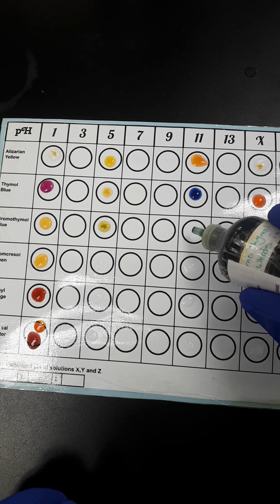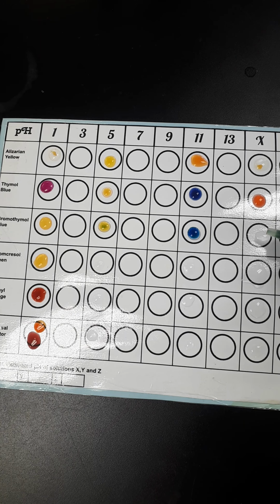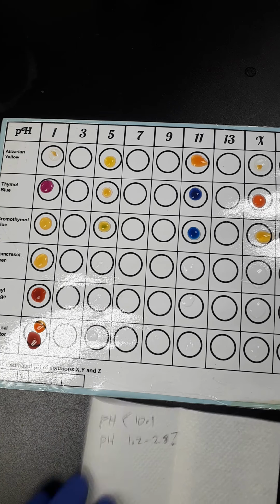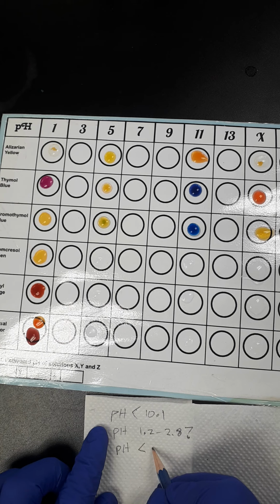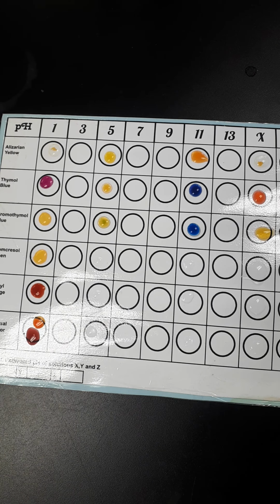Let's see, pH of 11. Definitely blue. And then our unknown, let's check it out, has definitely turned yellow. And that means for us, for bromothymol blue, if it's yellow, that just means that the pH has to be less than 6. Nice, okay, keeping track of things.